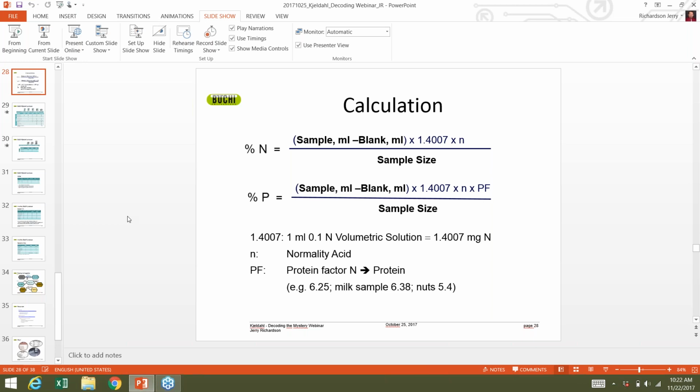If your protein source has the amino acids that make up milk, or the amino acids that make up a meat, those have different values that have been assigned, that have been calculated, and so we take them into account accordingly to convert the nitrogen from the primary calculation to that of protein. So simply put, it's a convention.